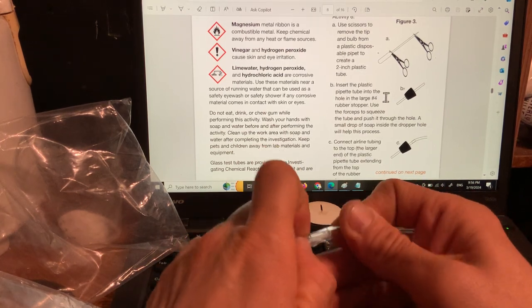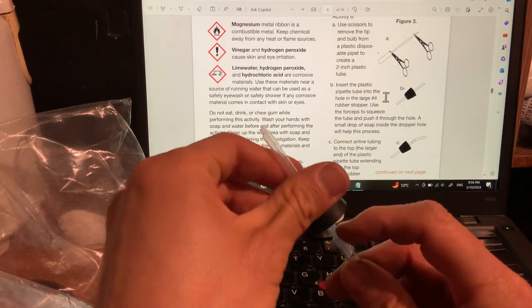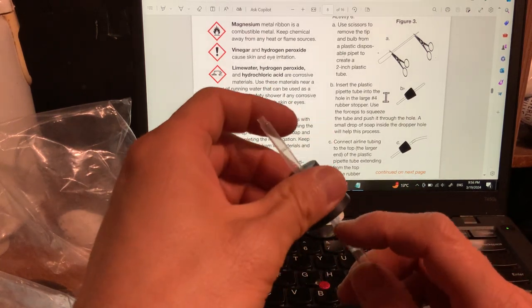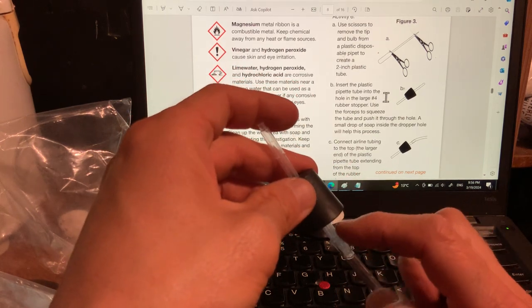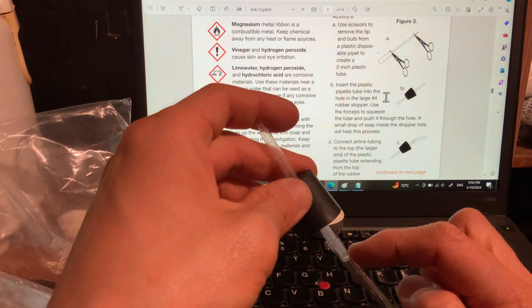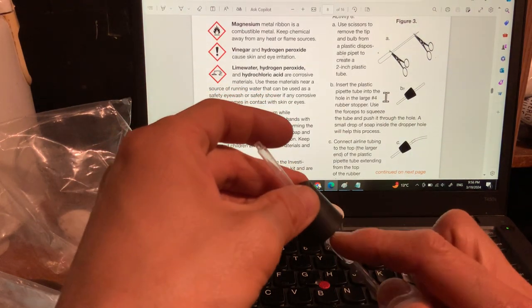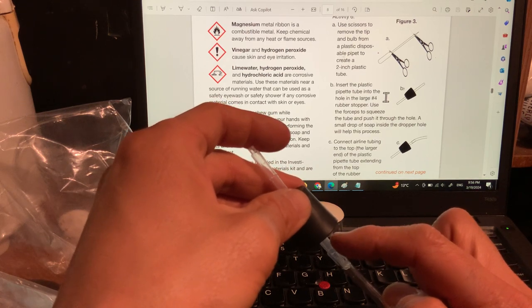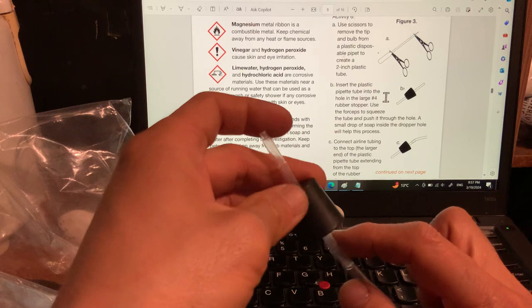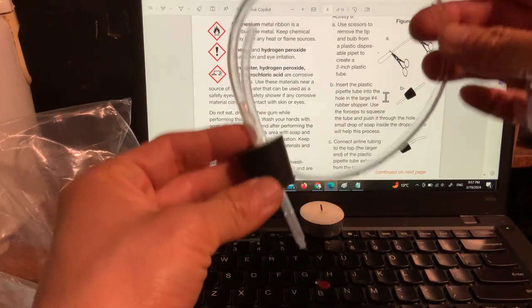Now you got to force the tube on some distance because there has to be no place for air to get out between the pipette and the tube. Okay, so the squeezed part of my pipette is inside here. It is not at the joint of the tube and the pipette. So I don't want any air coming out. Okay, this is my gas collection device.